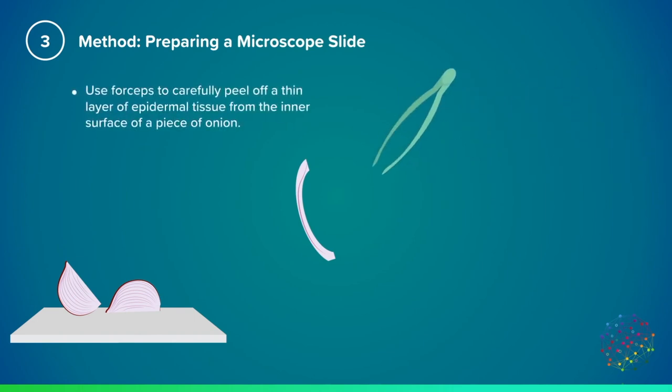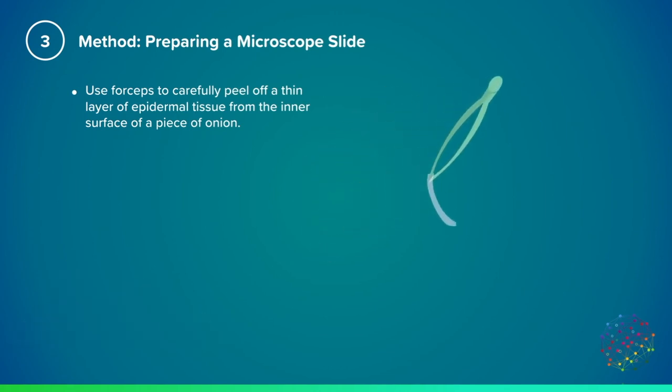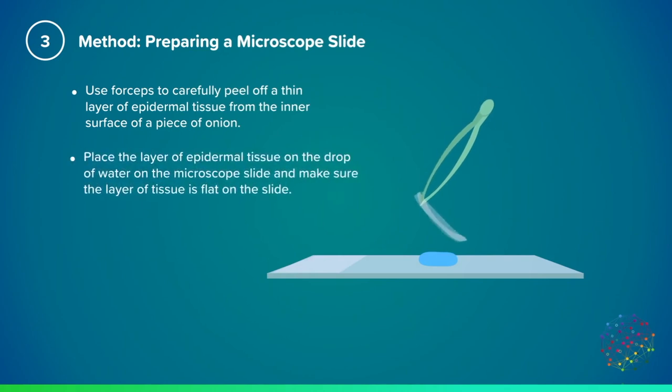Now use the tweezers or forceps to carefully peel a thin layer of the epidermal tissue from the inner surface of the piece of onion. It will be an opaque layer of cells that you can then put onto the microscope slide, making sure it's nice and flat on the water drop to be held on.